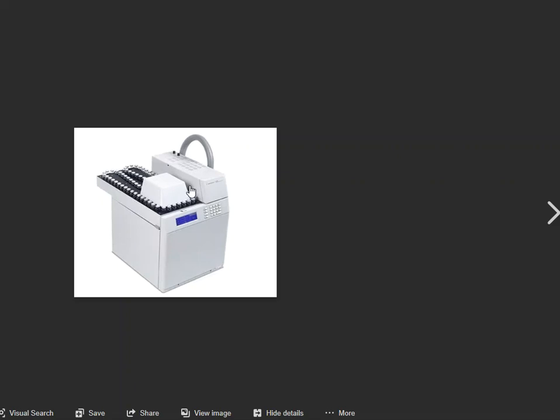The only thing its job is to process a sample and deliver it to the GC. So the GC will be waiting on a sample, and this Headspace unit will do what it needs to do: heat, keep it there for a long period of time, and then inject it over. When this gives the relay to the GC system, the GC will then kick in and say, okay, we've got a sample, now we're running it. And that is line number 1 on your auto sampler table on the software.